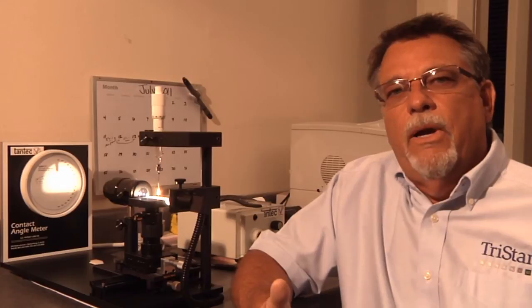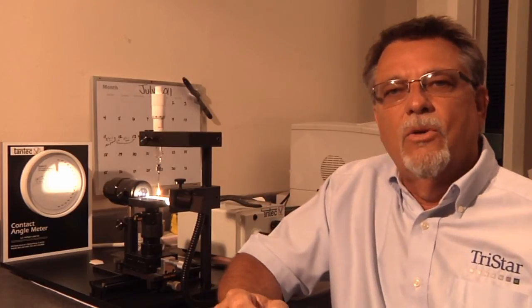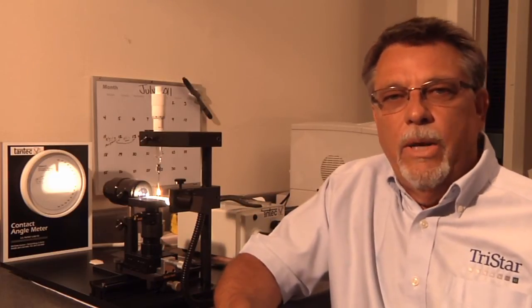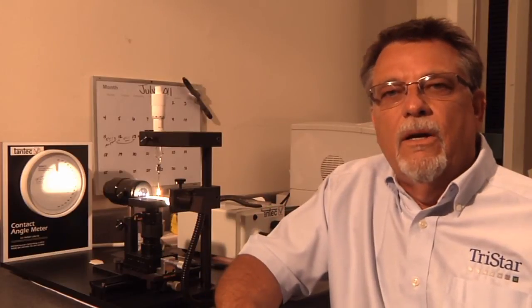The other unique thing about plasma is that we can dial this in so tightly and so specifically that if a customer comes to us and says we need a contact angle between 50 and 52, we can do that.